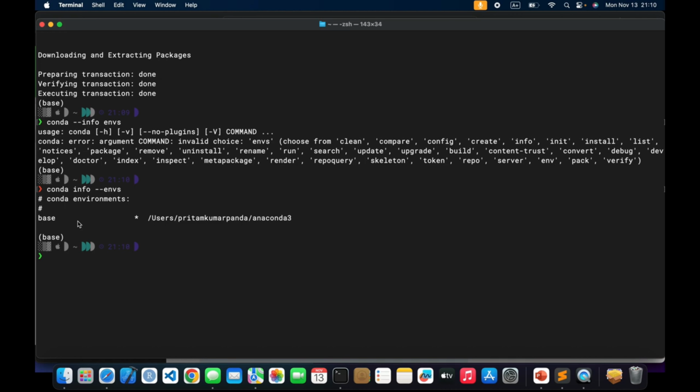But if you start a mini project, or if you start your project on RNA sequencing per se, and you want to install BioPython, you want to manage that version in another environment so that your base environment is not affected, right? So it's really important to manage different kinds of environments per project so that your base environment is not affected at all.